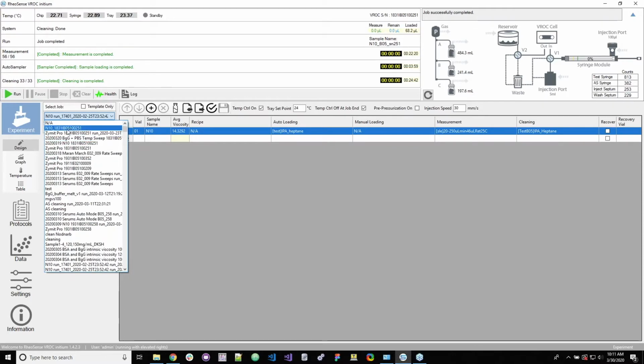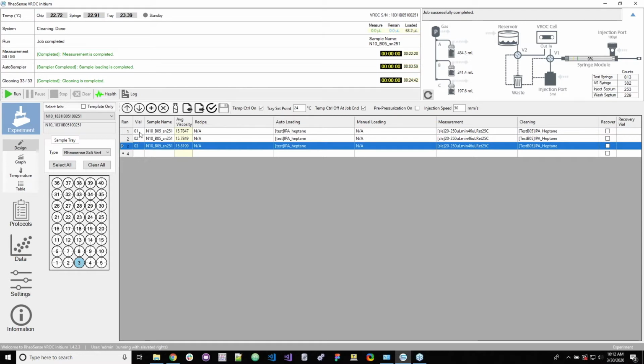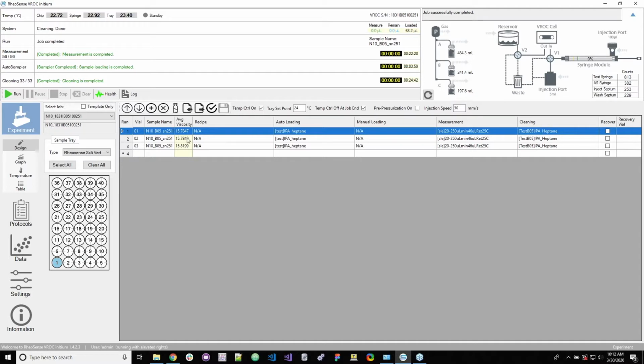So we'll go back to the first experiment or job that was saved on this instrument when we started this demo. And so here, if we look over to this big panel here, we have our job information. So which run, which vial. So if we have a 40 vial rack, we can go and add as many runs as we would like, but for this N10 run that we did, we had 3 vials, and we can name the sample anything we want. This average viscosity number is the average of all the viscosities from the run selected. This will populate once the run is complete.